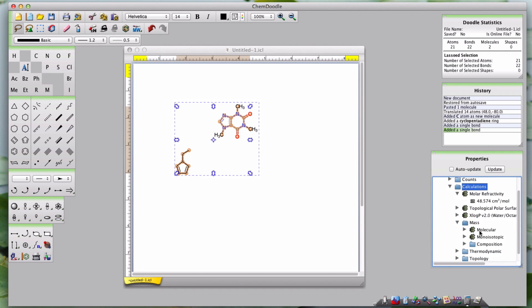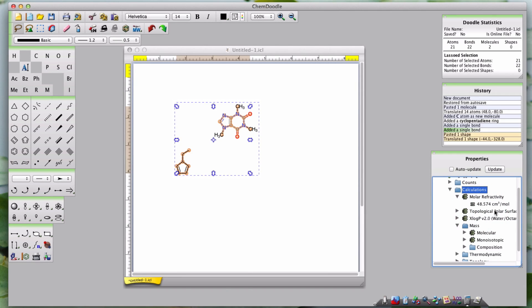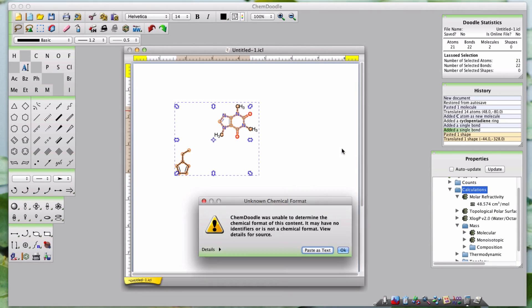You can copy data from the Properties Widget by right-clicking on any item in the tree and selecting Copy, then paste the information to your desired location.